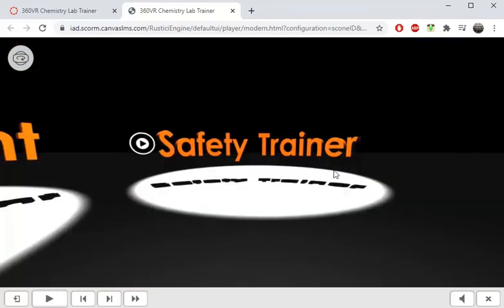I will go back to the main menu now. That's really it for this nutshell view of this project. I'm very excited to see how this process and technology is used moving into the future.